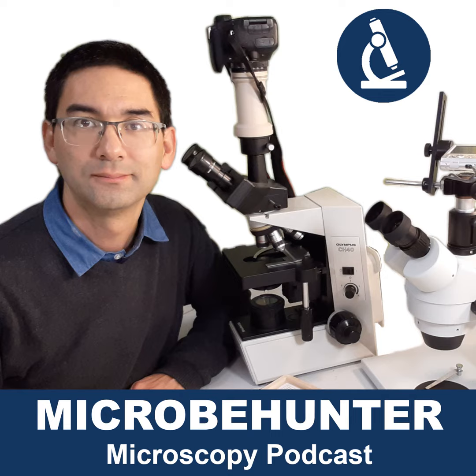Check out their web pages and you're probably going to realize that the high cost of many of these microscopes essentially already answers for itself. I mean, if you have to pay several thousand for a microscope, then this is often beyond the budget of an amateur. So in other words, the decision infinity or non-infinity often does not even appear because it's already decided simply by the price of these infinity microscopes.